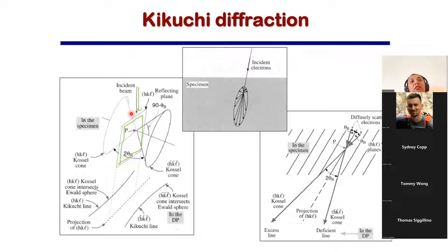And this is your inelastic scattering. That means you have losses involved. And what you see here at the bottom is that your center is simply seen in the center of the lines. And then there is the width of these Kikuchi lines. And this width actually represents your planes.